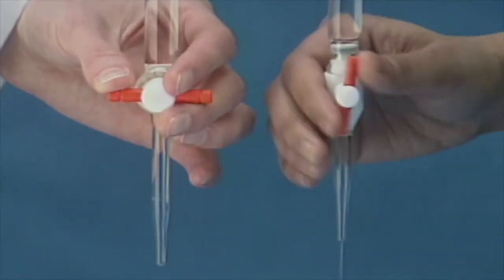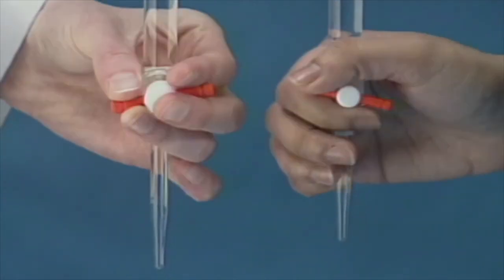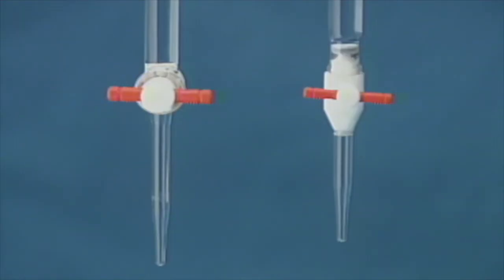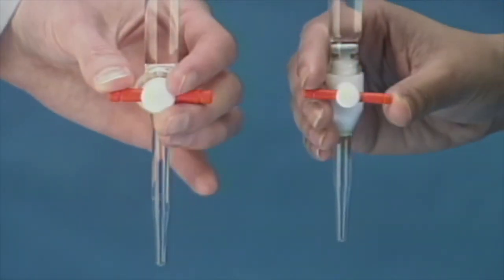On the right of the screen, we see that a quick 180 degree revolution of the stopcock delivers a very small liquid volume. On the left, we see an alternate technique, simply turning the stopcock on and off quickly.